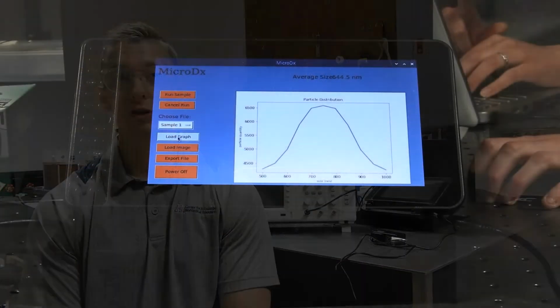and significant improvements will need to be made for the completion of these future phases. To ensure that safety and environmental standards have been met, we have integrated a completely closed-off enclosure so that laser light does not damage the user or anyone surrounding the system. To take this further, the user is able to power the laser on and off from the GUI before entering the system and replacing the sample.